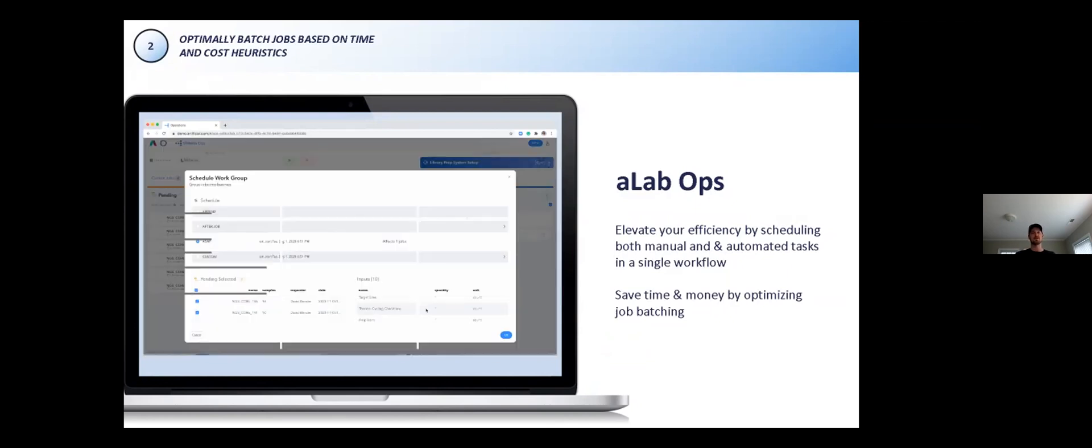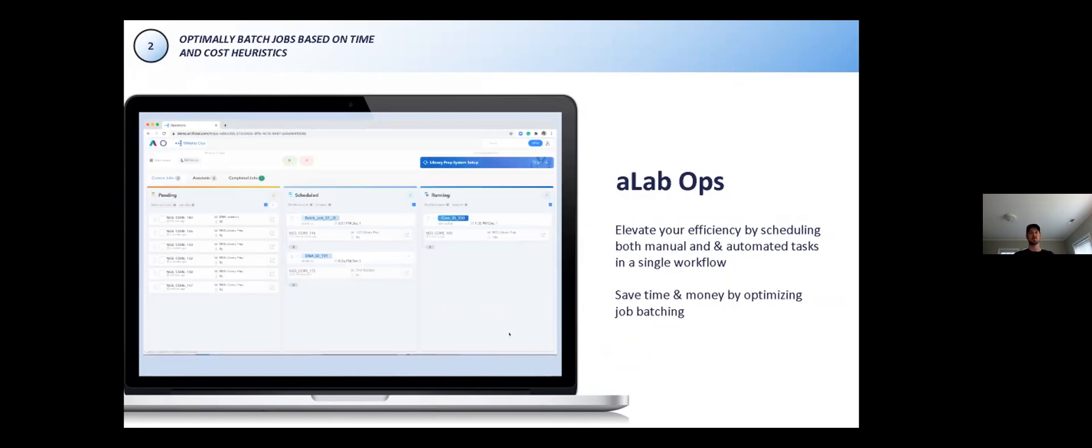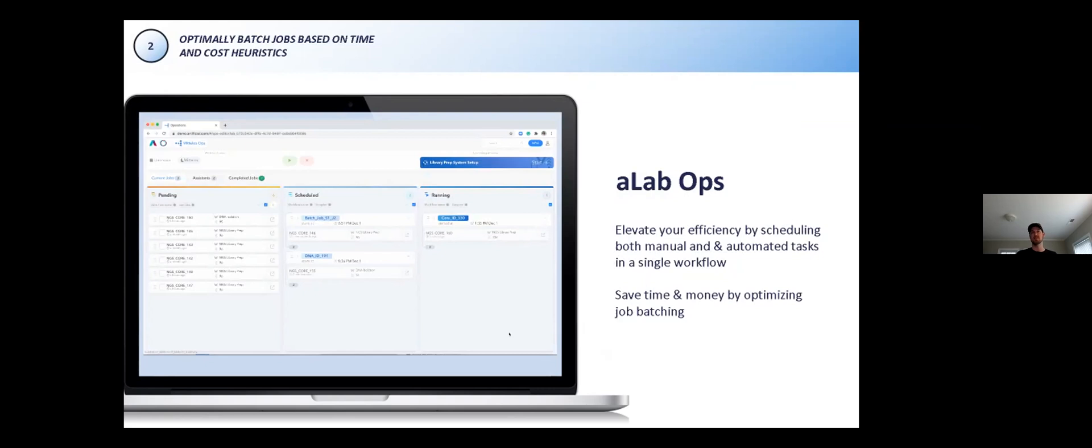Once batched, the request can be scheduled, inclusive of the manual and automated work required. On the top right of the screen, you can see a blue button above the running process. This is telling the user that they need to complete a manual step to get the system loaded or unloaded. The notification here could be coupled with a Slack or SMS as well, so they don't have to come necessarily directly to the UI to see that there's a manual step.